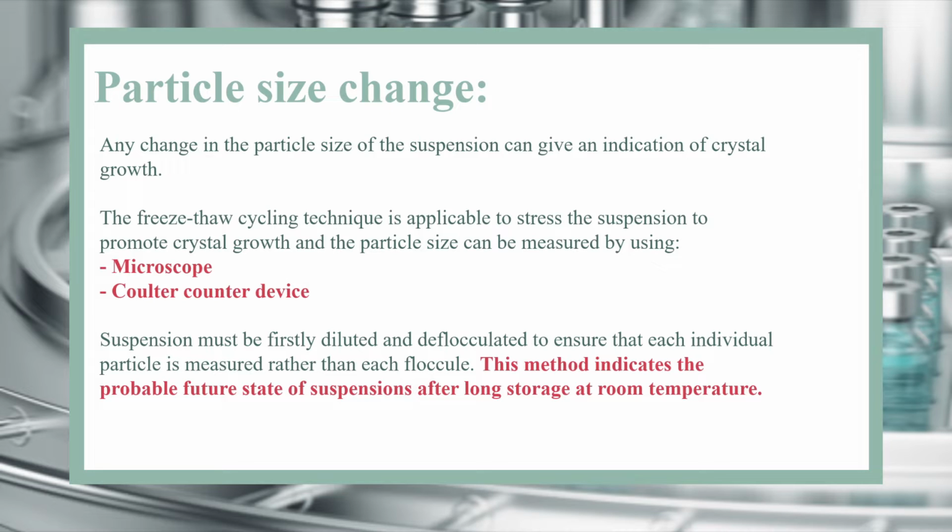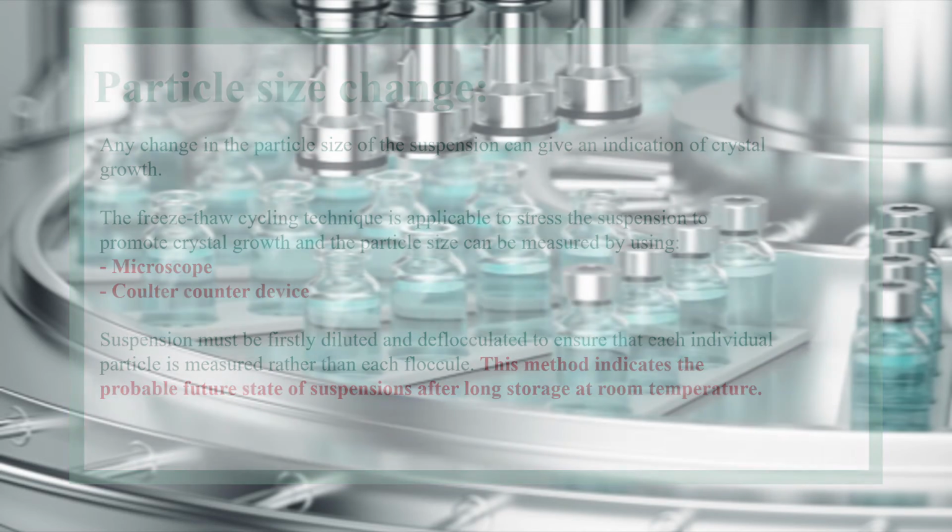Suspensions must first be diluted and deflocculated to ensure that each individual particle is measured rather than each floccule. This method indicates the probable future state of the suspension after long storage at room temperature.